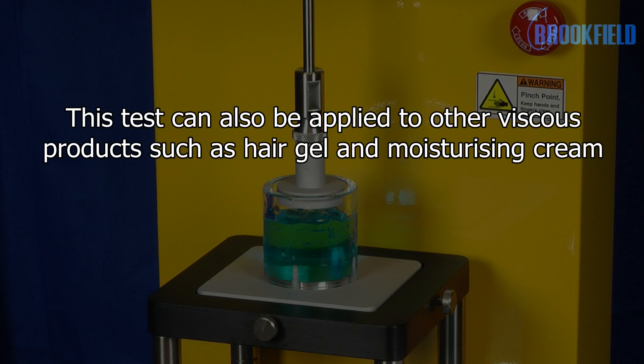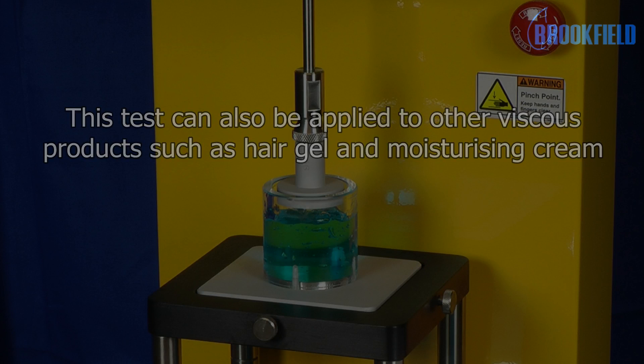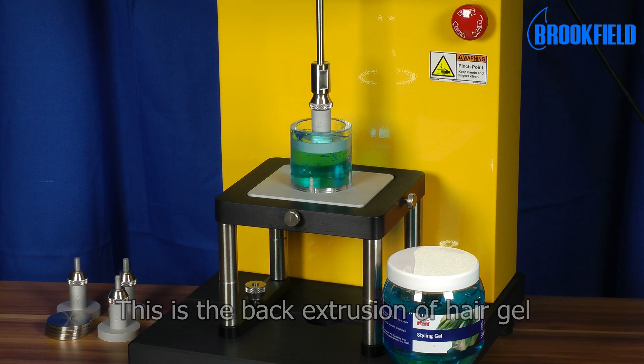This test can also be applied to other viscous products such as hair gel and moisturizing cream. Here we see the back extrusion of hair gel.